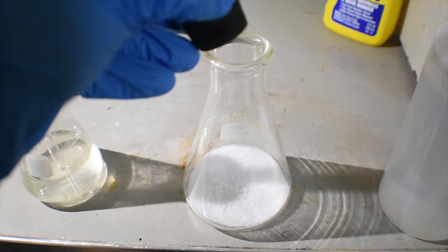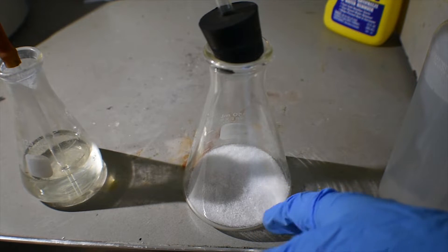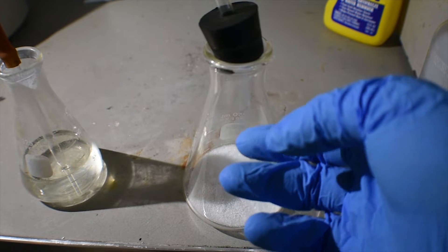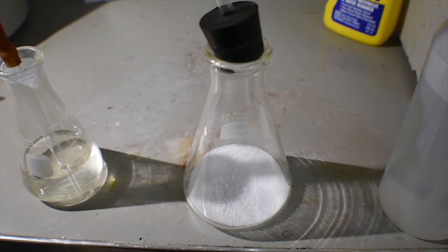Whenever you're ready, go ahead and add a little bit of water to this mixture of ammonium salt and sodium hydroxide. That will generate a good amount of ammonia which will bubble through, and eventually we will get a very thick white precipitate of the addition compound.